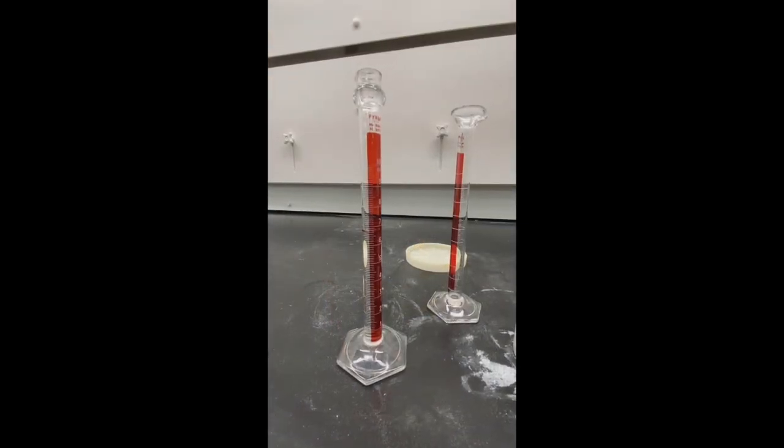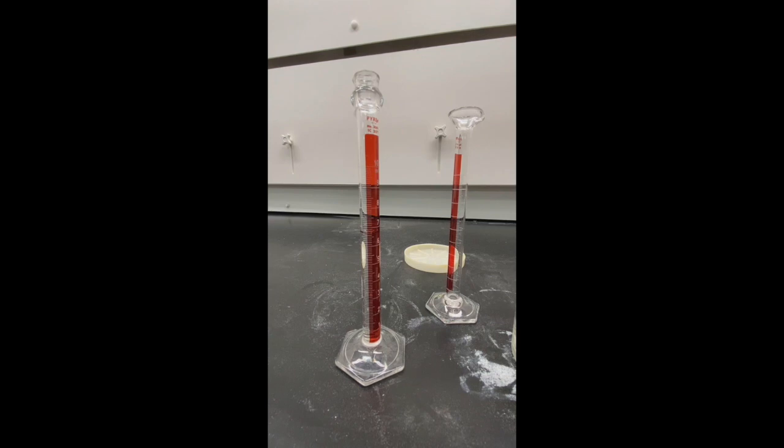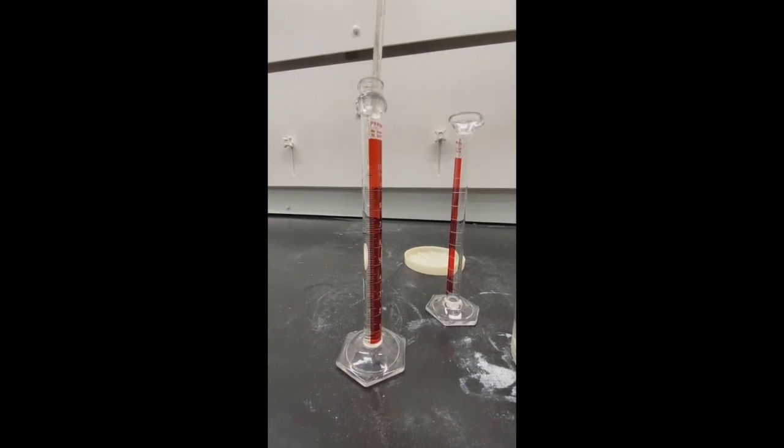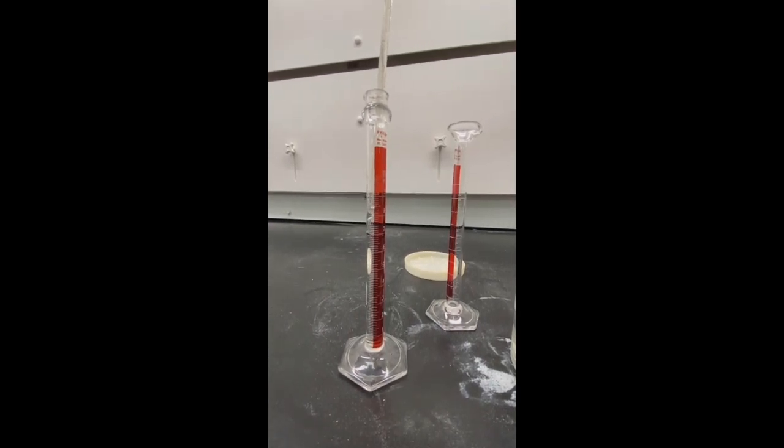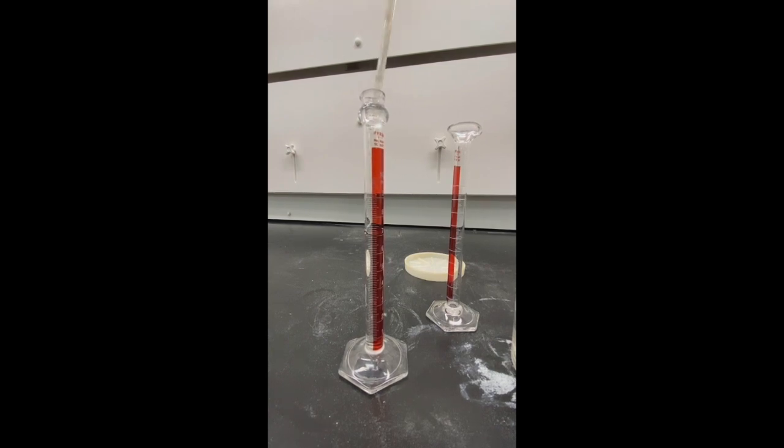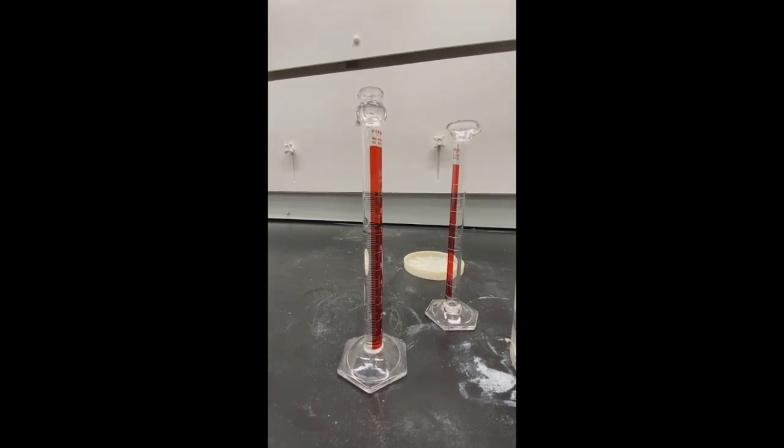I wanted 7 milliliters, so I poured close to the 7, and then I'm going to take the transfer pipette. I'm going to read this at eye level, and I'm going to add carefully dropwise to the bottom of the meniscus is exactly at 7.